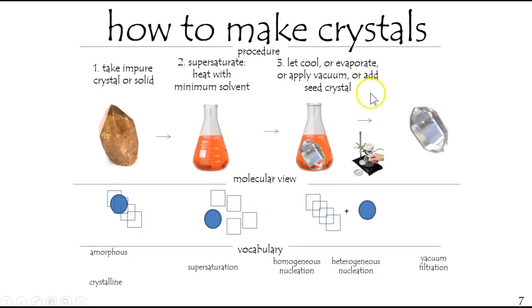Seed crystals, this process is known as heterogeneous nucleation. Letting it cool would just be homogeneous nucleation, since you're not adding anything. And nucleation in general is the process of crystal formation, the very first molecule.